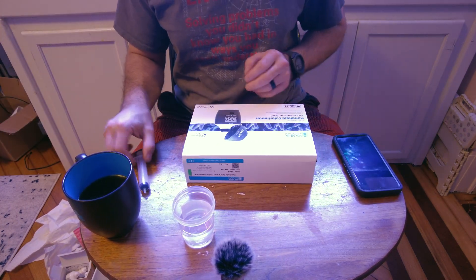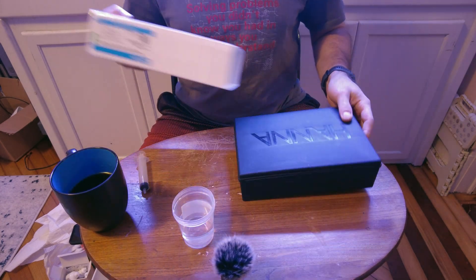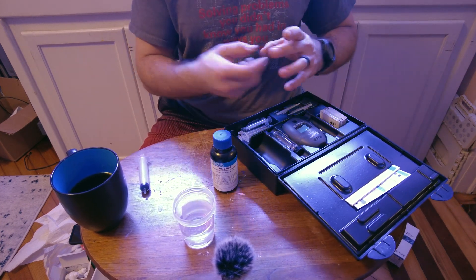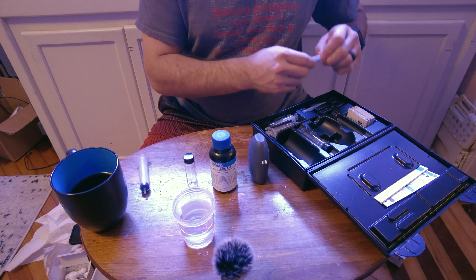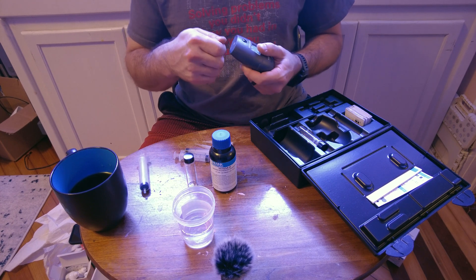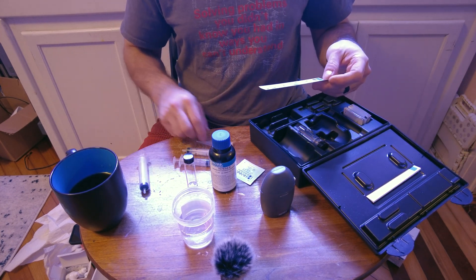Now we're moving on to the Hanna Checker, which should hopefully be much easier. This comes in a larger case, mostly because the reagent bottle is huge. You get two cuvettes and the magnesium checker itself — I already put the battery in. Getting the batteries in there the first time is a giant pain; you've got to get like a razor blade in there to pop it open. We need one pack of powder reagent, and it comes with two 5 ml syringes with tips.